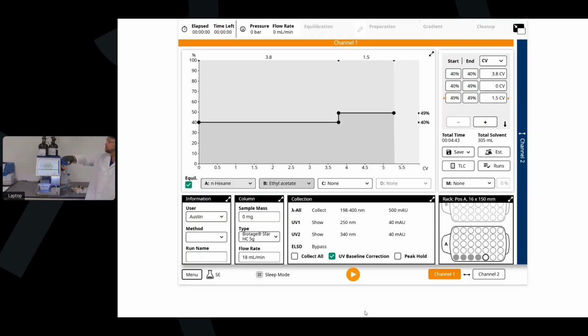On top of our bottles, we do have our liquid level sensing module. This module is designed to track solvent consumption before and after runs. This allows us to make sure that when we start a run, we're not going to run out of anything. As the user, you don't want to start a run, come back later and find out that everything was for nothing. So it protects you. It also allows us to keep track of all the waste generation and make sure that our waste is not going to overflow, and also how much we're actually creating. So we can track and monitor our complete workflow in that sense.